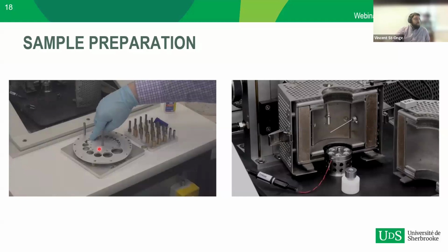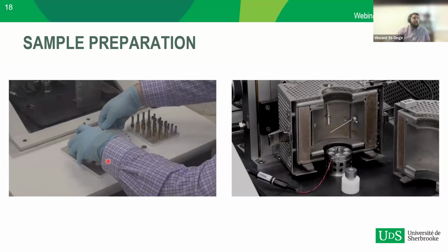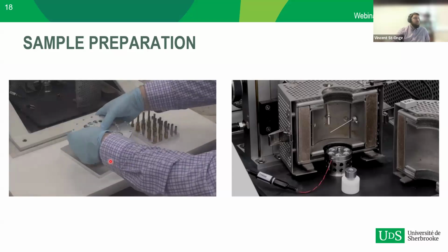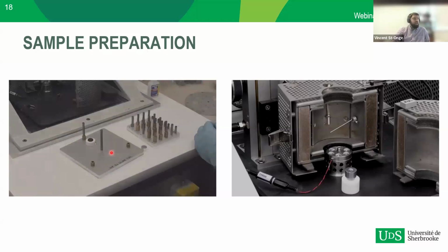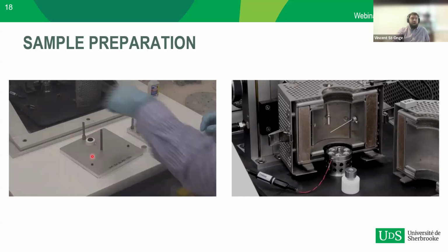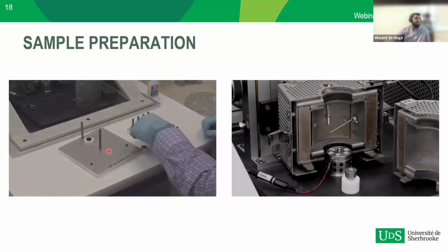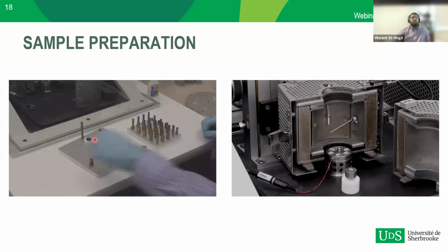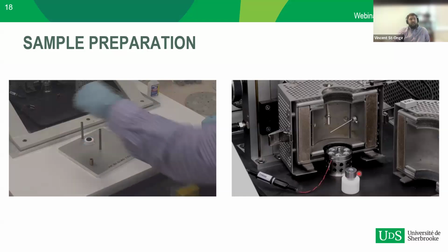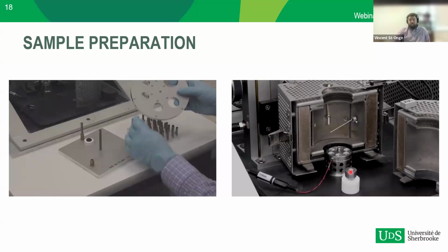Hold it in place for a few seconds to make sure that it sticks very well. It's a contact glue, so it sticks. It takes about 30 seconds for it to stick, and then about 5 to 10 minutes to dry completely. And then we repeat the process, because on the top of the sample, we will be placing a little mass on which we will be able to screw an accelerometer.